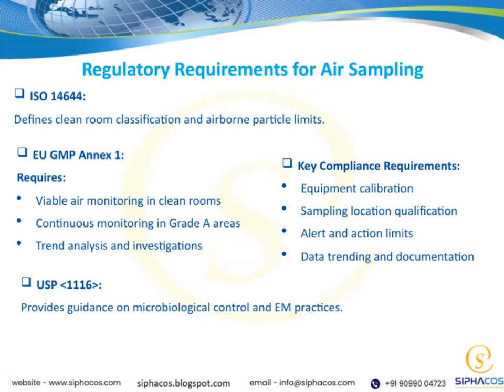Let's take a closer look at USP 1116. This guideline provides essential direction on microbiological control and environmental monitoring practices, helping us maintain the integrity of our sterile environments. Moving on to regulatory requirements for air sampling, there are several key compliance areas we need to focus on.